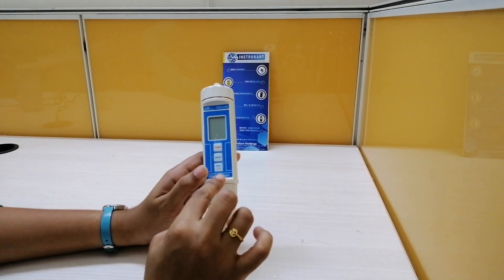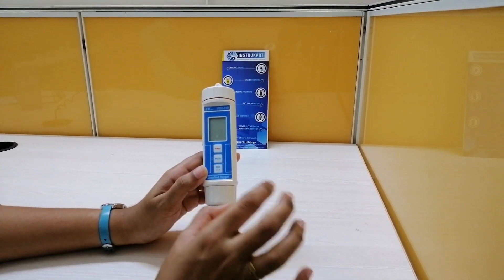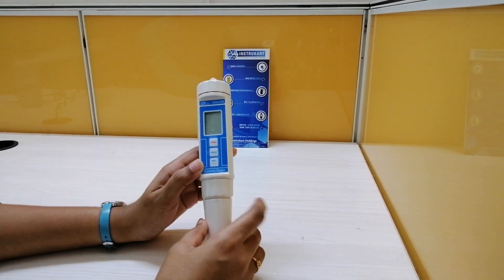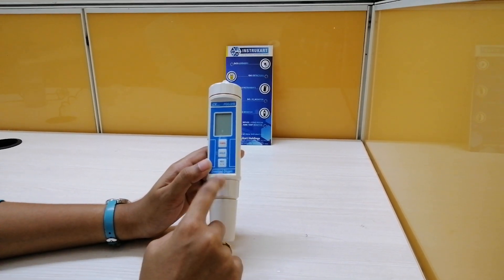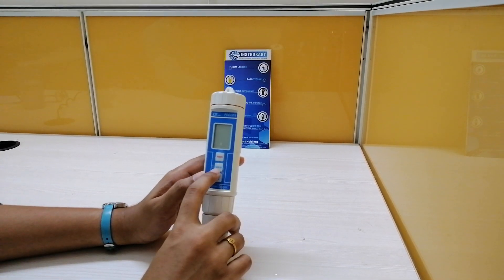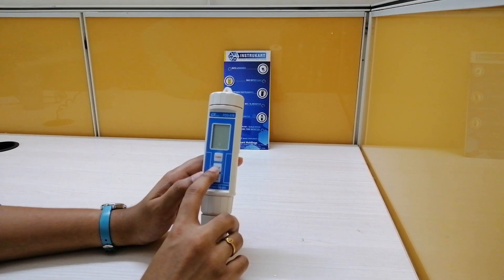Coming to the sensor structure used in this meter, it is a polarographic type oxygen probe with an incorporated temperature sensor. Coming to the memory recall, it records maximum and minimum readings with recall function. We also have auto power off to save battery life, data hold to freeze the display reading, and the sampling time is approximately 1 second.